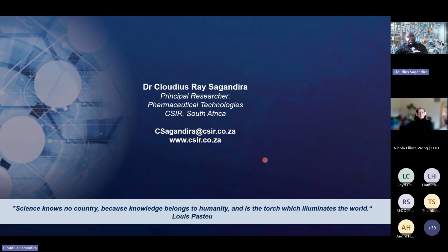But if you are building your own, and I know Francis quite well because he's on the side of doing some engineering and trying to build his own systems, that requires a lot of effort and knowledge around engineering principles. At this point in time, you have to try to use open source technologies out there to find help on how to do the scale up in a manageable way. Otherwise, it's very difficult because these commercial companies don't show you how it's done and how they can size up in a smart way.